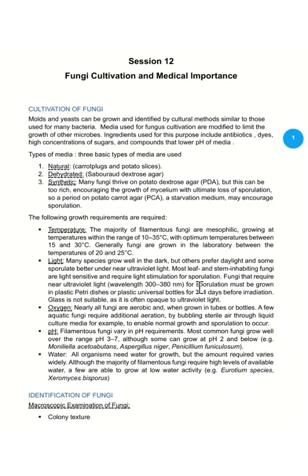So if this type of fungi requires ultraviolet, you need to prepare ultraviolet, and this is available in the microbiology lab, to incubate them in ultraviolet incubators. And it's better to grow or culture this type of fungi in plastic petri dishes, because glass prevents the penetration or transfer of the ultraviolet light.